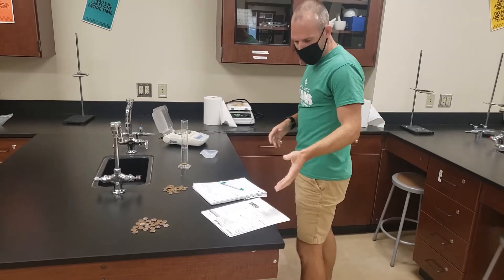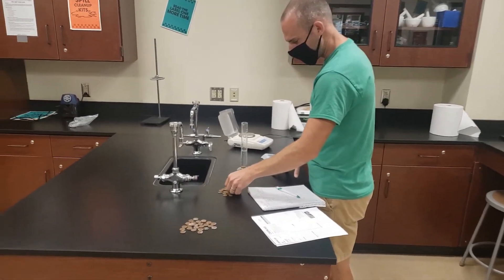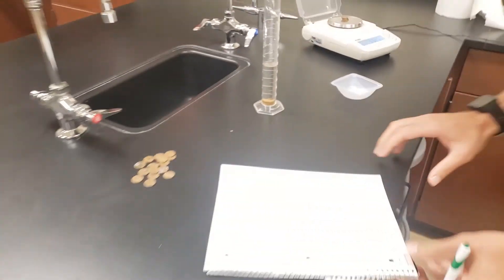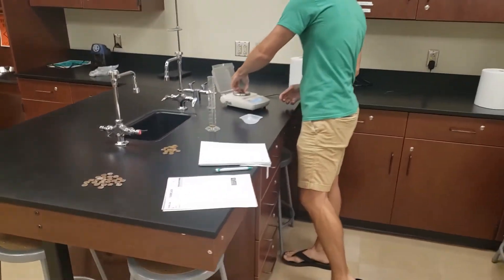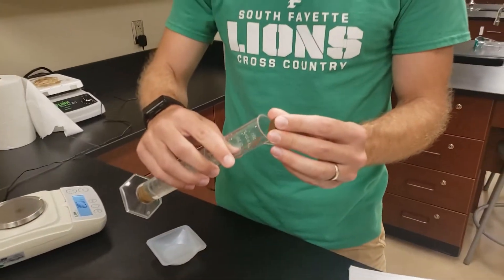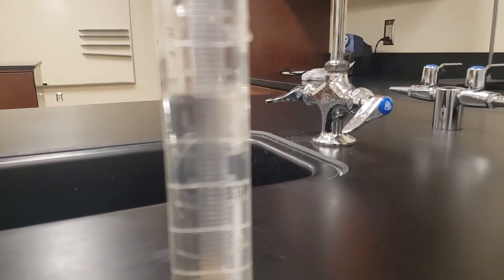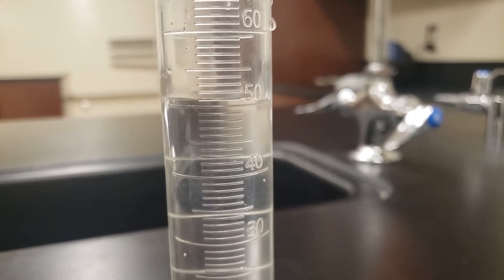In step 7 of the procedure, it says to repeat steps 5 and 6, which is to get a new set of 5 pennies. Place those 5 pennies on the digital balance to determine their mass and record that in my data table. Then take those 5 pennies and add them to my graduated cylinder in the same fashion — tilt the graduated cylinder so as not to splash. If there are any bubbles, tap those out. Then record the new volume again to determine the volume of water displaced by adding those 5 pennies.